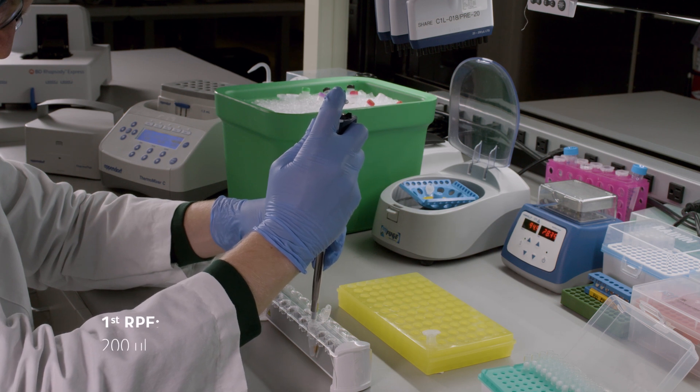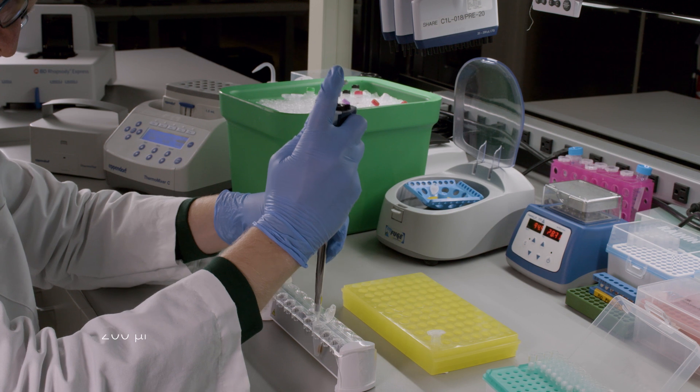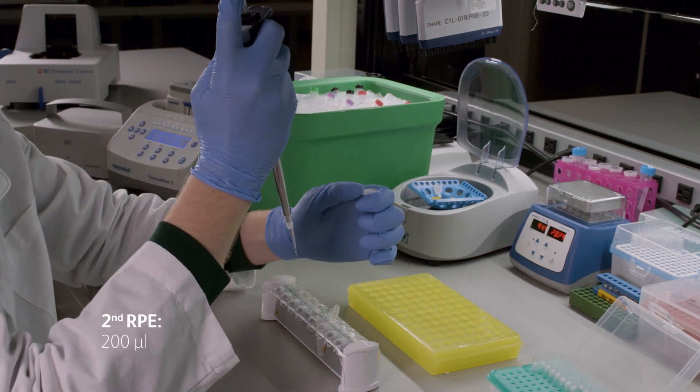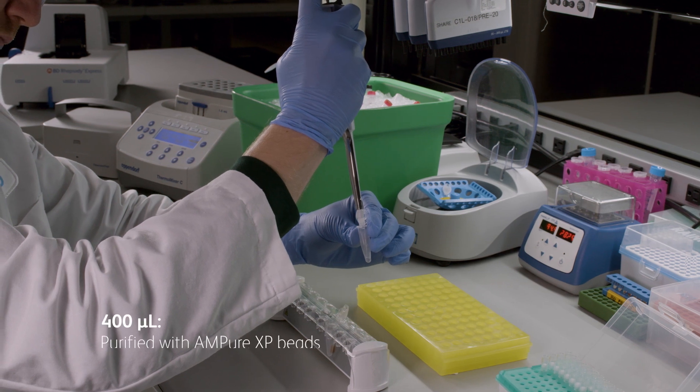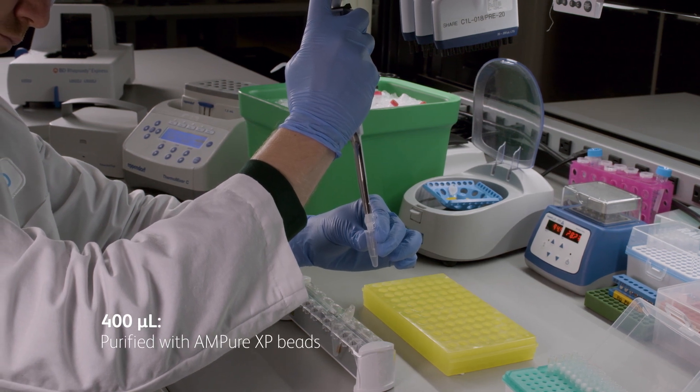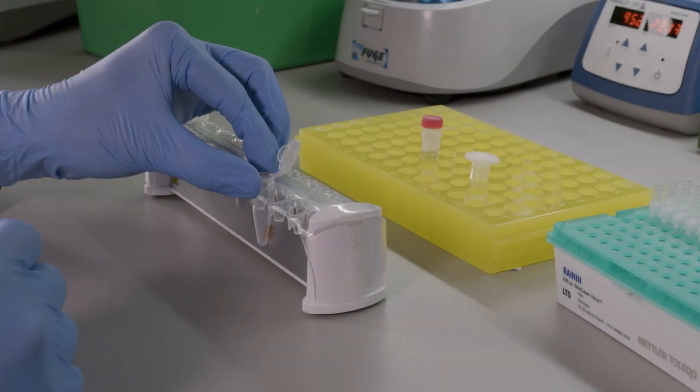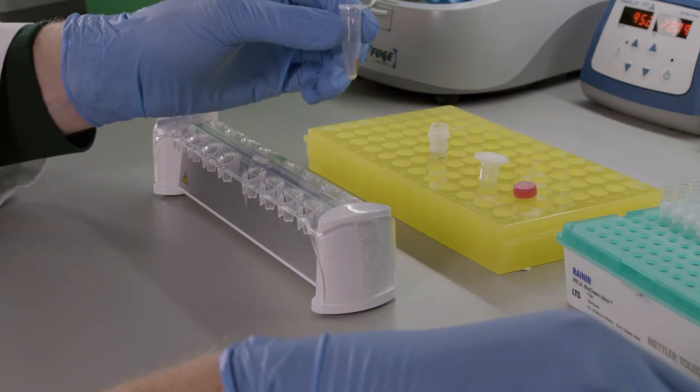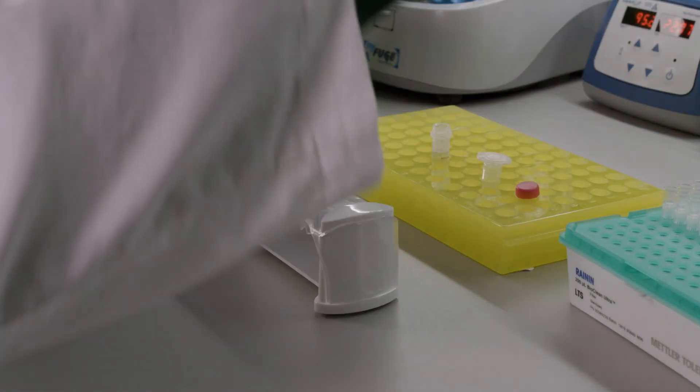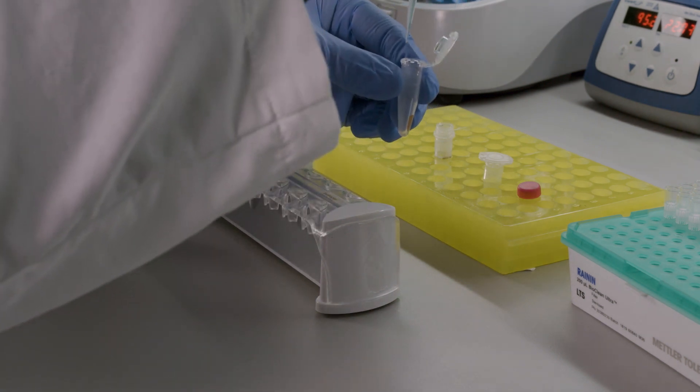Remove the tube containing the beads from the magnet and perform an additional RPE reaction identical to the first. The products from each RPE reaction will be combined for a total volume of 400 microliters and purified with AMPure XP beads. The beads remaining after collecting the RPE products from the second RPE reaction can be resuspended in cooled bead resuspension buffer and stored at 4 degrees Celsius for up to 3 months.